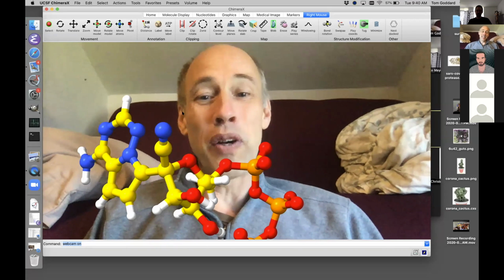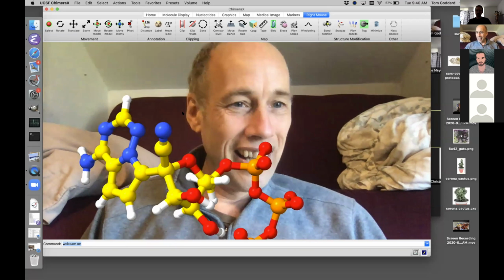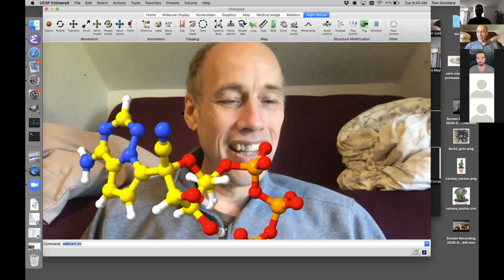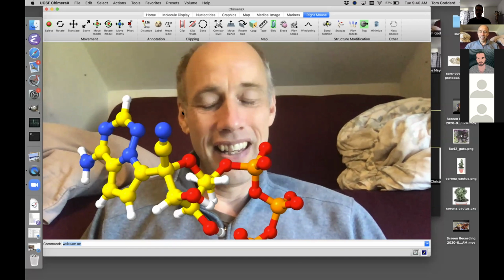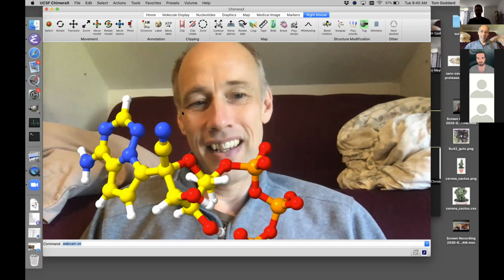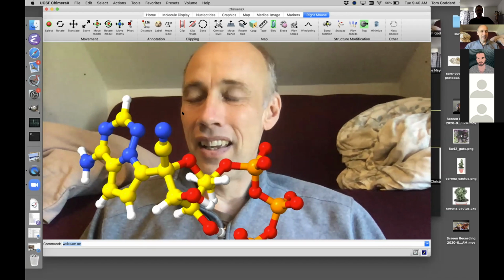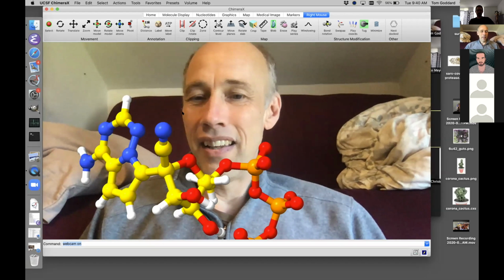So any questions? Yeah, I'd like to say great demo, but I was wondering, Tom, if instead of seeing your face, can you project where you are, say, the protein, and move the protein around? And so you'd have two images, one left hand, one right hand controlled. I don't know, I'm just guessing.